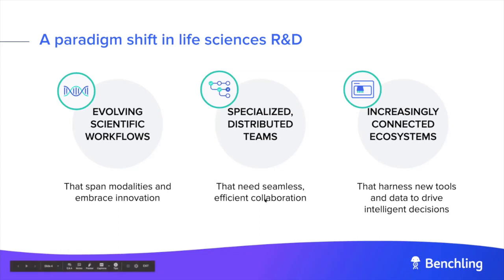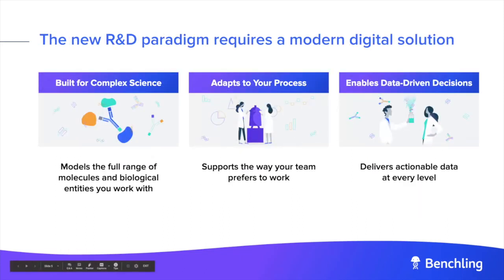Unfortunately, the software to support this transformation hasn't necessarily kept up. Life science companies are being asked to rapidly integrate new discoveries and deliver more complex products faster than ever, and they are constantly running into artificial barriers of their legacy R&D platforms to do new things. Quite simply, software and digital infrastructure has not kept pace over the last decade, and many companies are left managing critical processes using pen and paper, spreadsheets, and homegrown technologies that are difficult and costly to maintain and don't necessarily meet the present or future needs of their R&D programs. We think every company and scientific team deserves a solution that will accelerate and support your innovations.